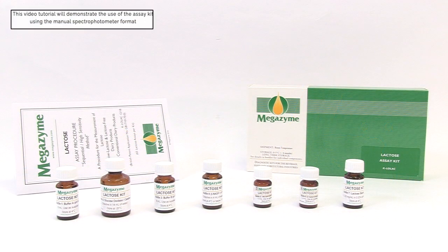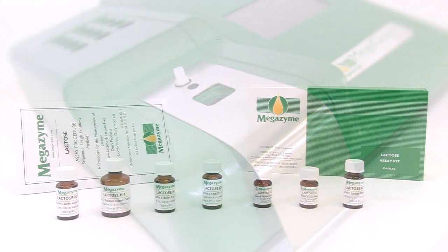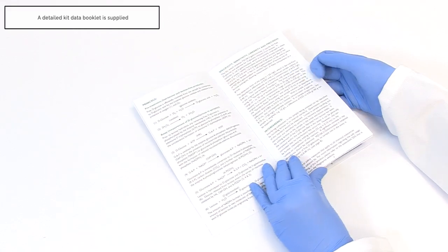This video tutorial will demonstrate the use of the kit with the low-lactose milk sample and the kit standard using the manual spectrophotometer format. The kit contains sufficient reagents for 65 manual assays and is supplied with a detailed data booklet.